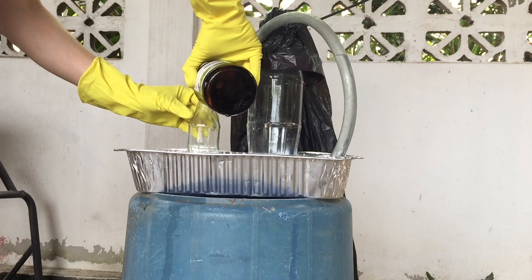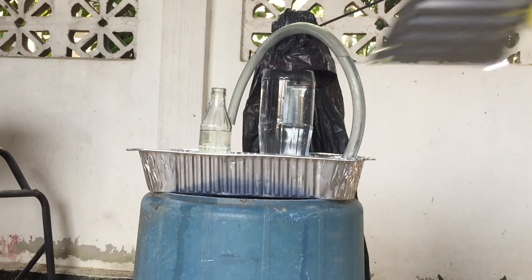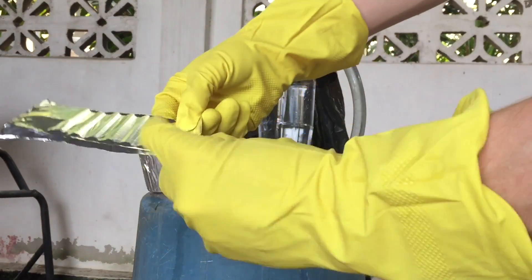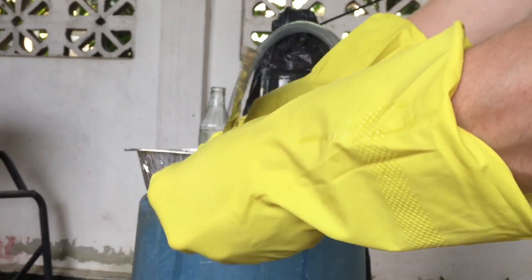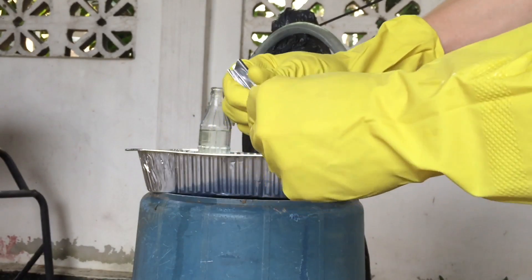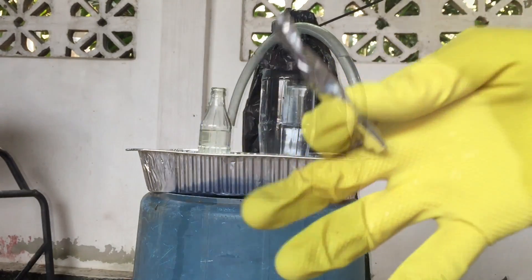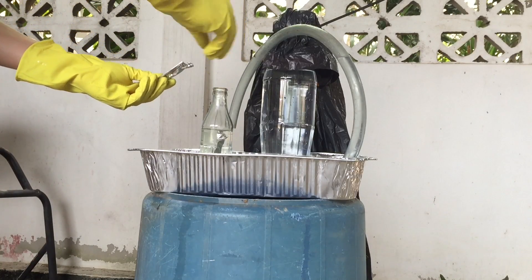Once again, be very careful when using the hydrochloric acid — always wear gloves. The source of aluminum can be aluminum foil, but I used a cut-up sheet of aluminum from the heat sink vessel. I rolled up the aluminum and put three of those rolls in.